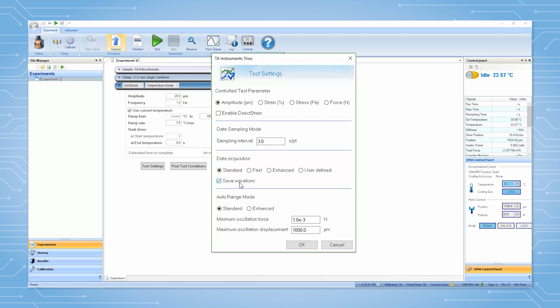Save waveform allows for a graphical force displacement waveform to be saved for each point and viewed later. Under auto range mode we will use a minimum force of 0.001 newtons and a maximum displacement of one millimeter.